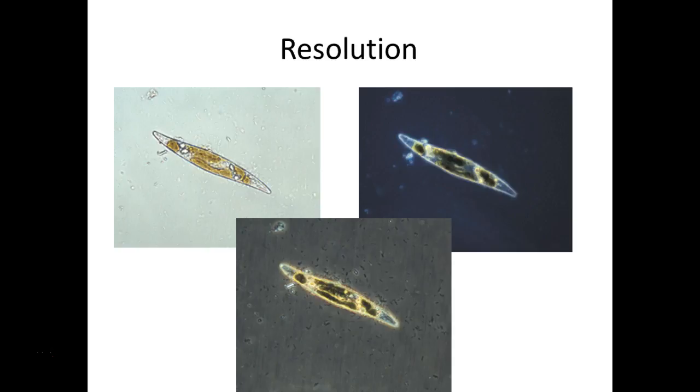With this, it's a light focusing problem. It's the lenses. And on the microscopes, unlike our lenses in our eyes, you can't change the shape of them. They're set. They're glass. Just like your glasses, you can't change them, right? So if your eyes change, what do you have to go do? Get a new set of glasses, a different prescription, where they mold that glass just a little bit differently. So for our microscopes, we know the level of resolution because we know what the prescription is, you could say, for our lenses.